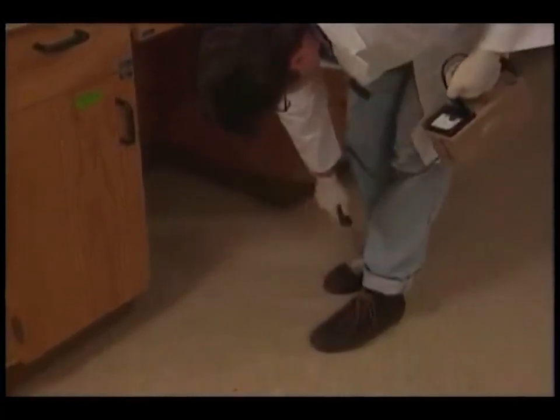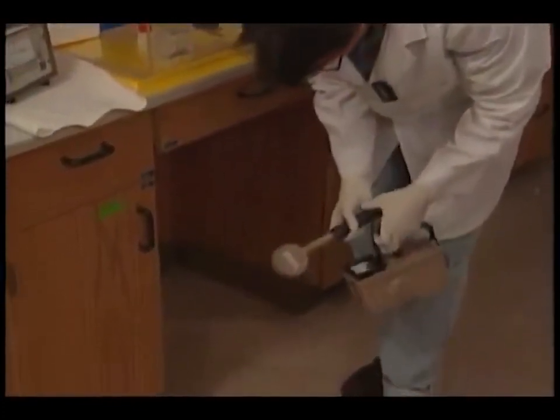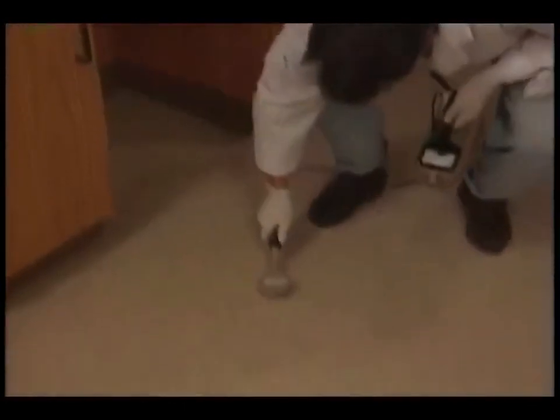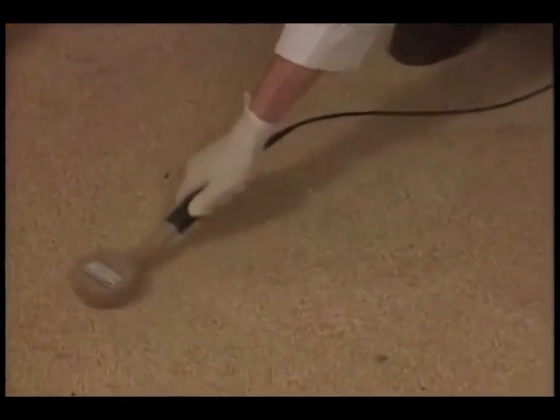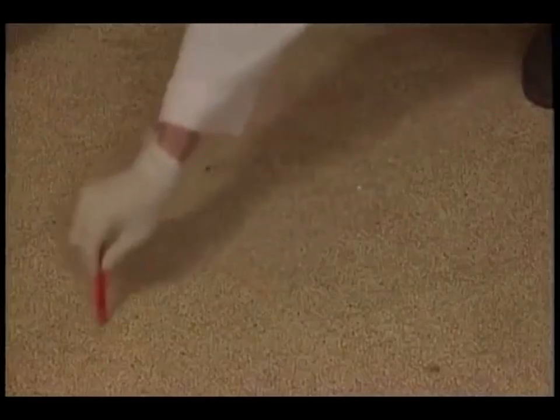Personal safety comes first. The next order of business is to identify the extent of the spill. It's crucial to prevent spilled material from being tracked to other areas. Otherwise, a small cleanup may turn into a big project. That's useful guidance for any kind of spill.